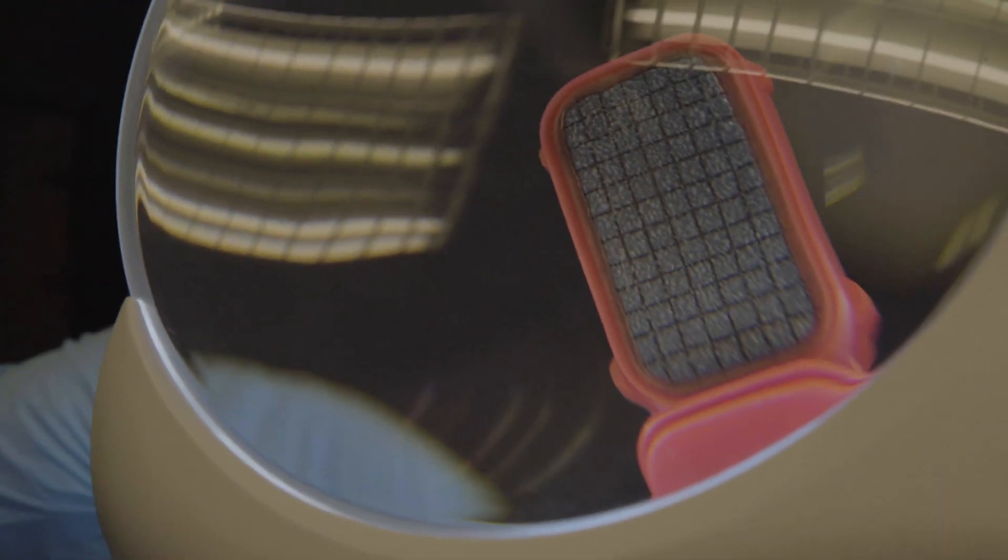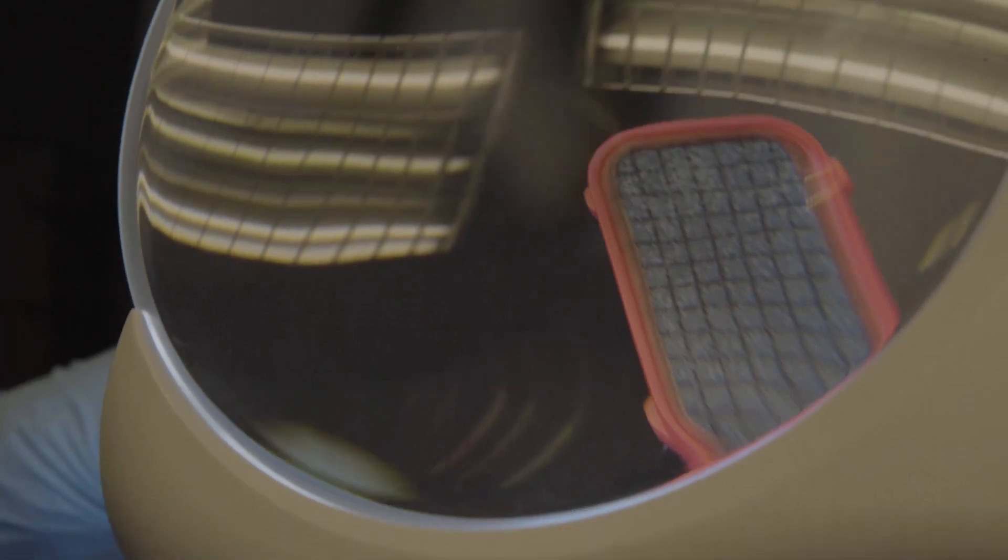Negative growth samplers do not show this clearing effect. Don't forget to magnify and photograph the sampler.